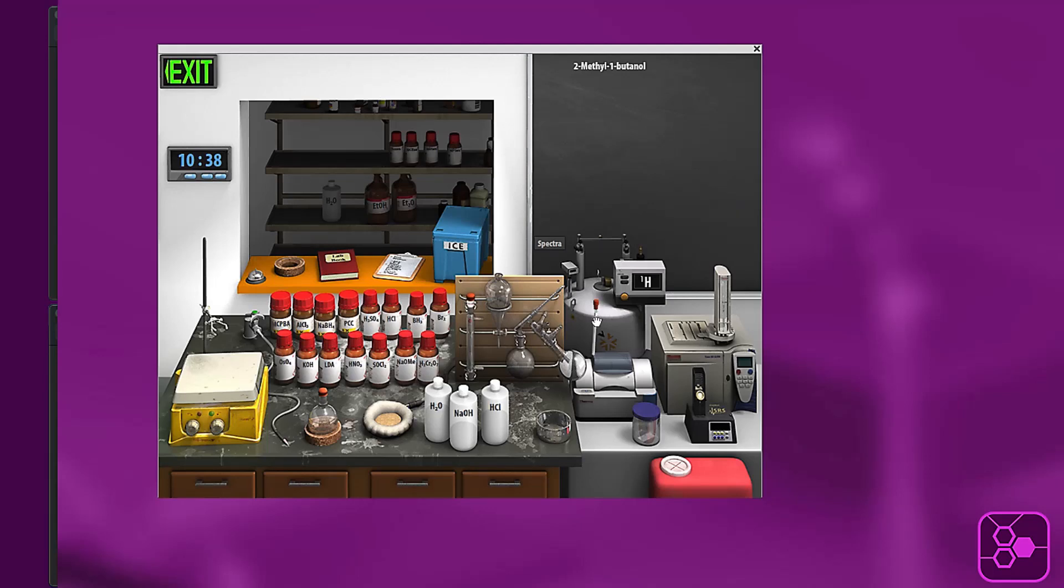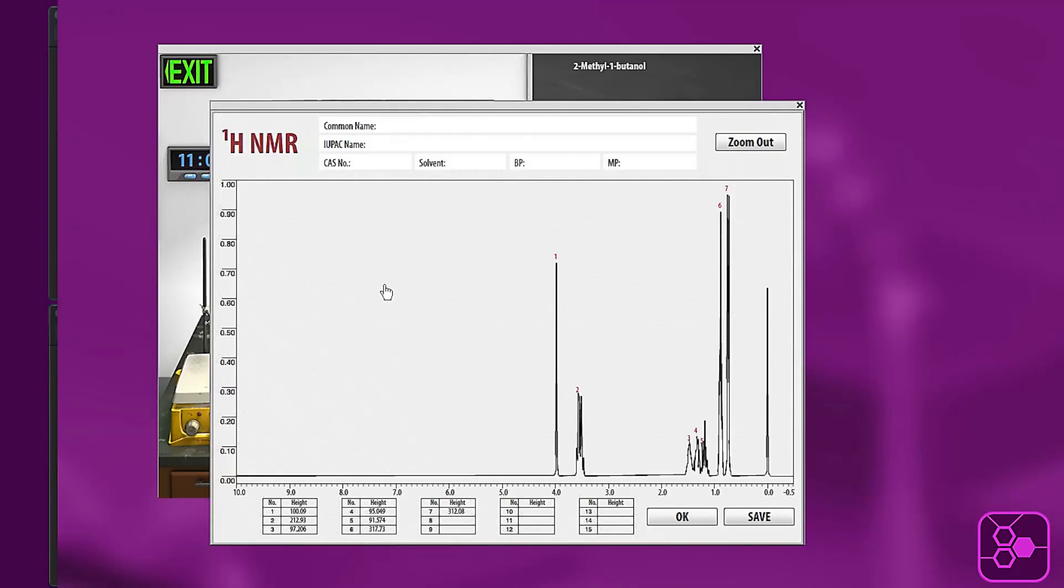So you click on the instrument and it will bring up an NMR tube and you just drag it over to your flask. Once you set it on the flask you should get a spectrum that comes out.